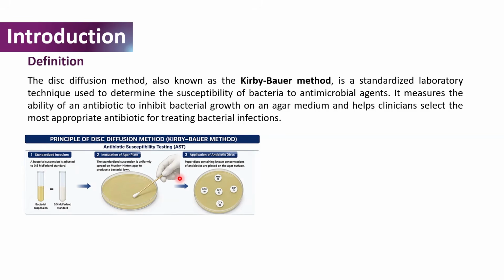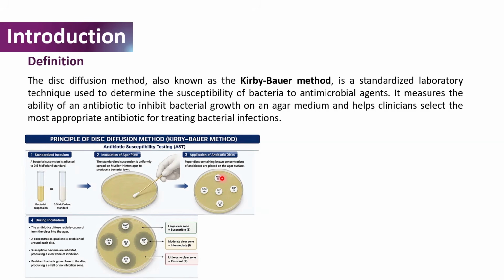And after allowing it to stand for these few minutes, paper discs containing a known concentration of antibiotics are placed on the agar surface and then incubated. During the incubation, the antibiotics diffuse radially outwards from the disc onto the agar, as shown in the picture here.